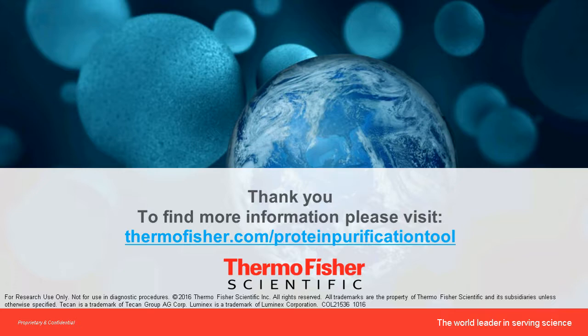A lot of times, our criteria is we like to see at least 3 peptides with high confidence from the MS spectra before we do the fold enrichment calculations. And if we don't see those peptides, we usually exclude them. But we are looking for at least 3 unique peptides for the target that we want to calculate the fold enrichment.